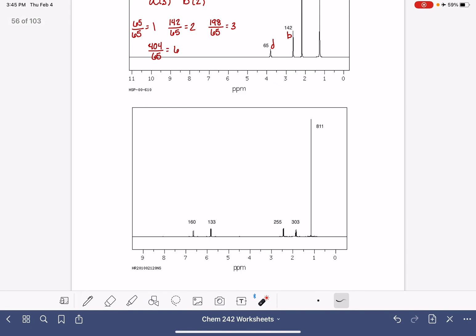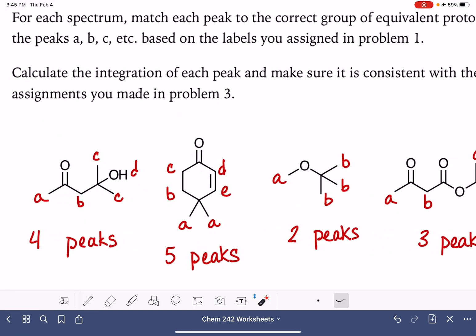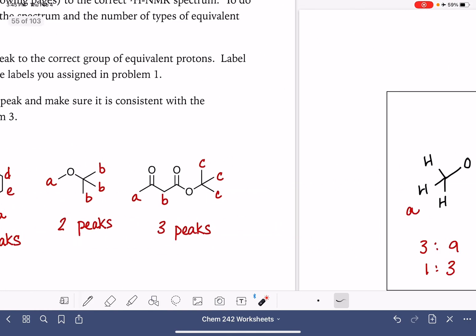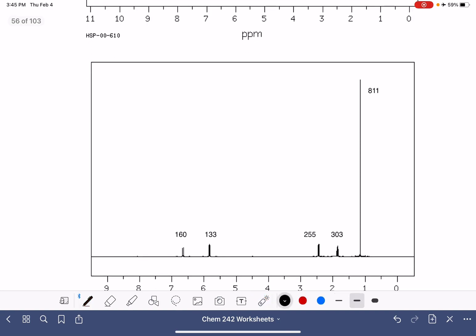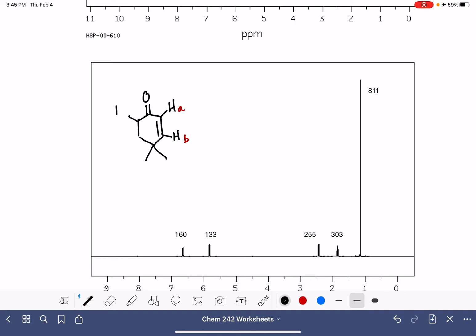Our last spectrum has five peaks, and that corresponds to this molecule. Let's analyze this spectrum. We've got a couple of protons which we'll label A and B, a couple more labeled C and D, and some protons down here which we'll label all as E.